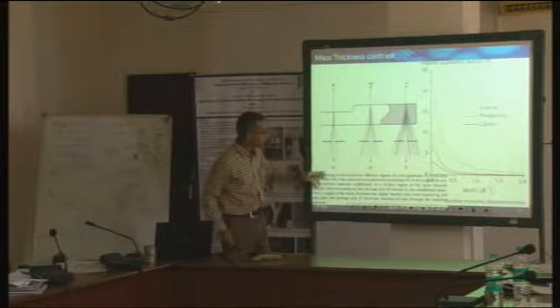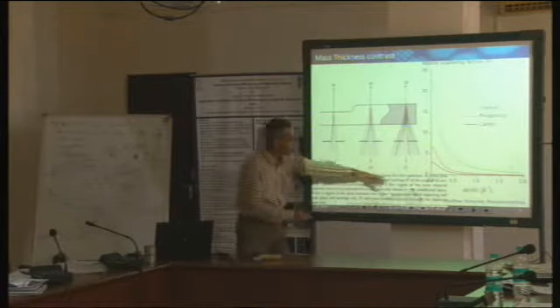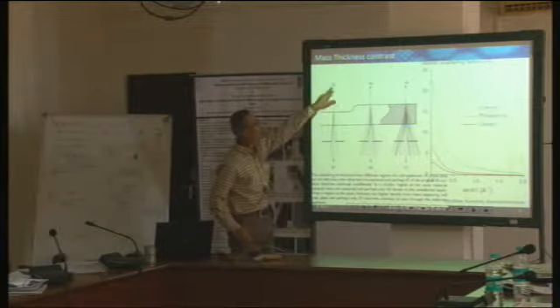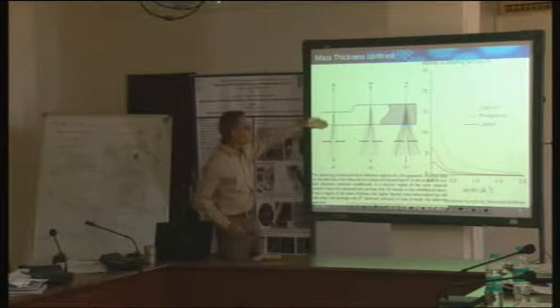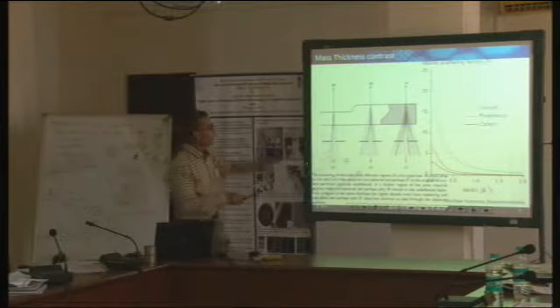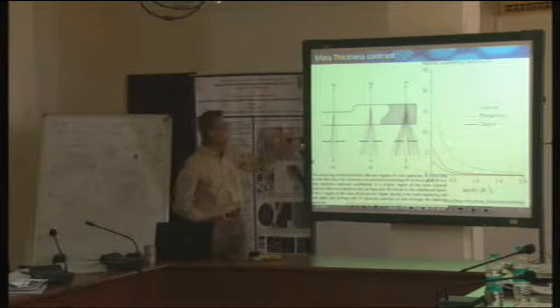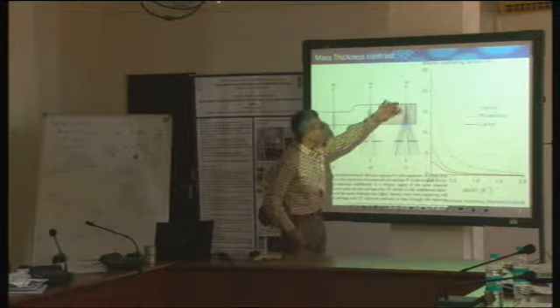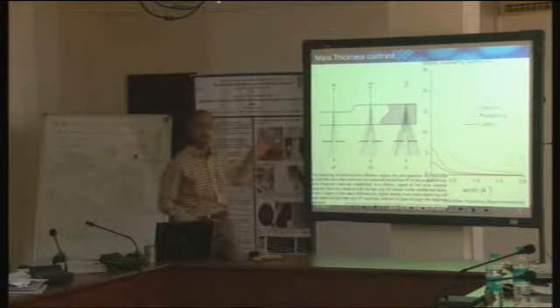Now I have my objective aperture, and if you read it at your leisure, there is some explanation here. It says that, let's assume, there were 50 incident electron beams. This is just for understanding. Of the 50, 47 managed to remain in the same beam. They don't get scattered at all. Here, the element composition is still light, but the thickness is more. So of the 50, 43 remain and 7 manage to get scattered. In this case, it's not only thick, it's also heavy. So 37 remain and 13 get scattered.